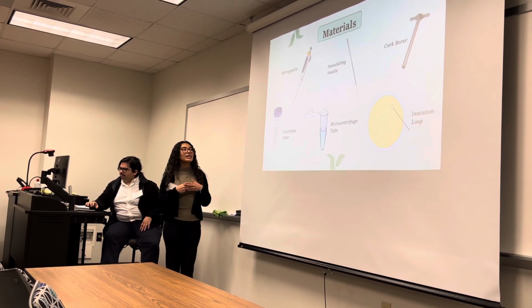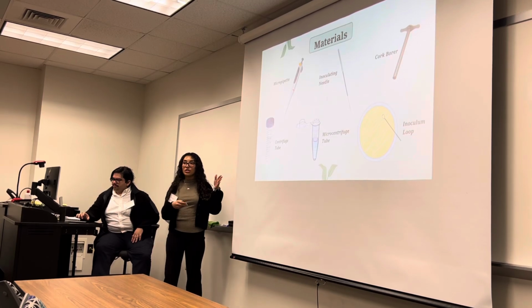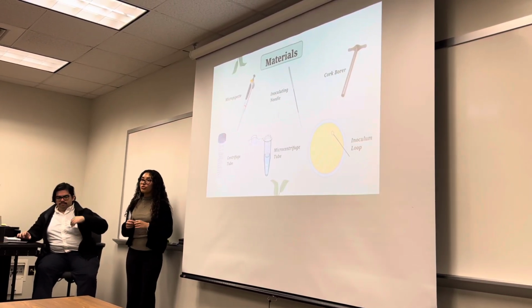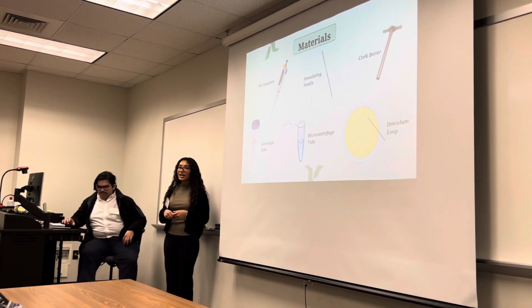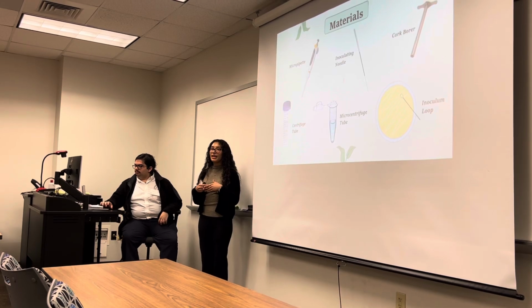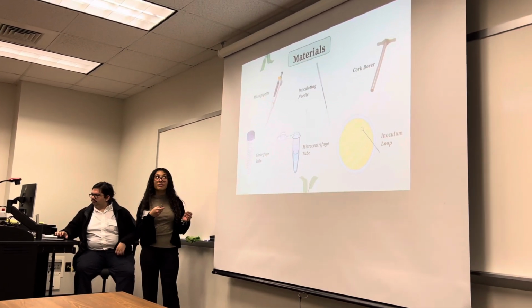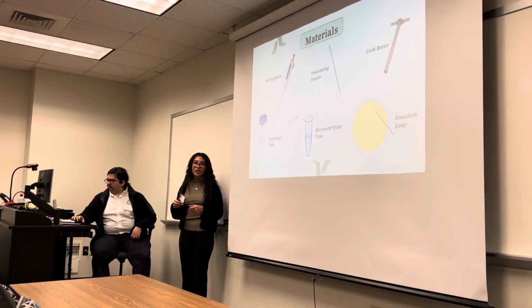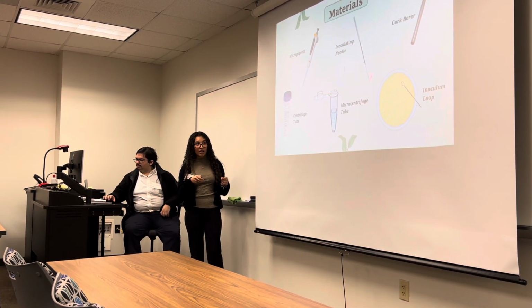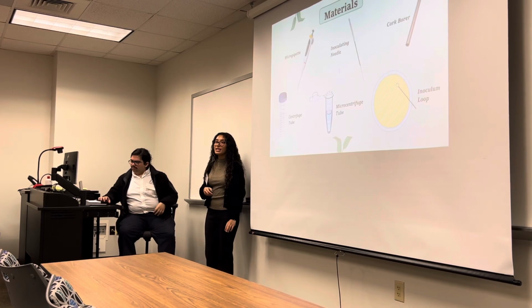By collecting the soil samples, I used a microcentrifuge tube to put the soil samples in, and we refrigerated them, and then we added saline to make a type of slurry mixture. From there we used a micropipette to take some of the slurry and put it into one of the 4 microcentrifuge tubes to create dilutions.